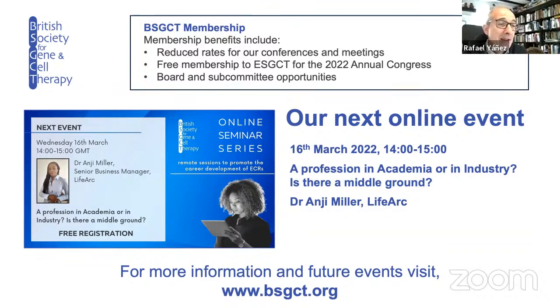And the seminar itself has been really interesting. Giulia, I think obviously AAV is a really fashionable technology, highly effective, with a number of marketed treatments already, and so many more in the pipeline. And it's great to see that an academic institution like UCL has been able to set up an effective platform in order to make this available, not just to the gene therapy community, but perhaps other people who have an interest in using these vectors, but not necessarily the capability to produce them. So that has been great.